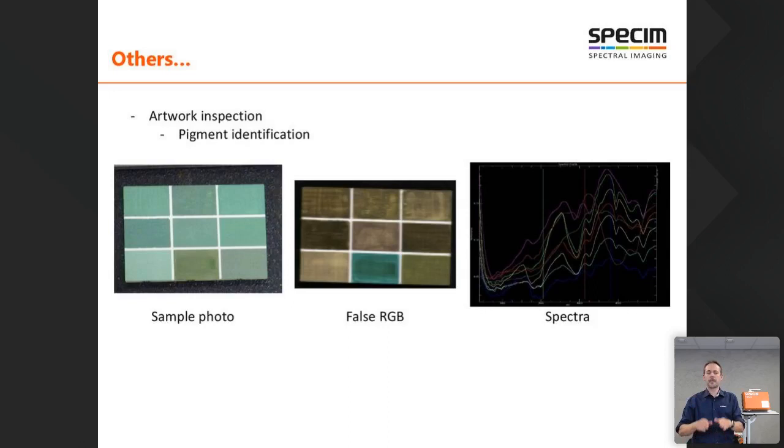So we measured, and with our illumination, with the scanner moving at about 20 centimeters per second, which is easily doable with our system, we noticed that the temperature of the painting was rising by only 3 to 4 degrees when it was passing underneath. So that's not much. Once we tested that, we started to put some real paintings underneath. I cannot show them, but I can show actually a test of different types of pigments.